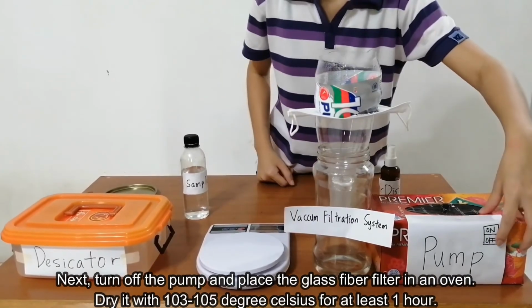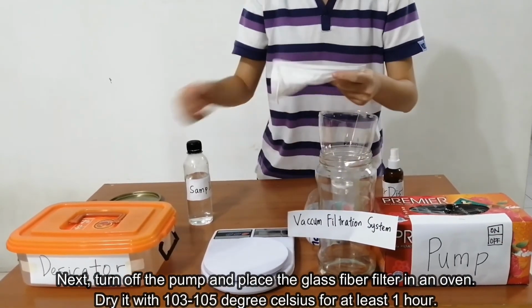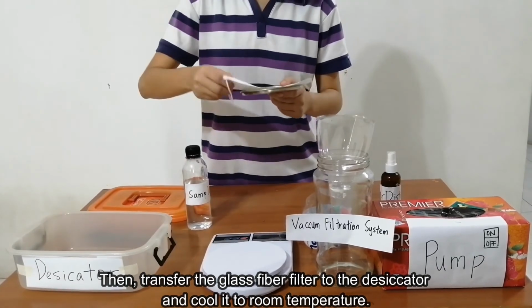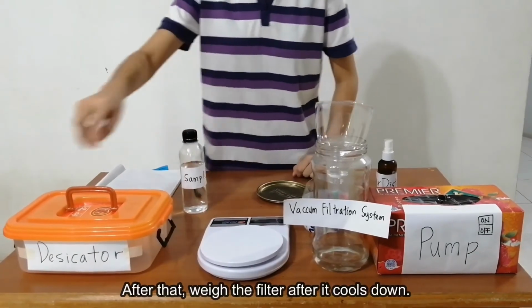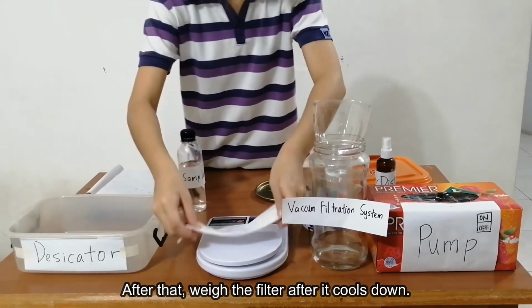Next, turn off the pump and place the glass fiber filter in an oven. Then transfer the glass fiber filter to the desiccator and cool it to room temperature. After that, weigh the filter after it cools down.